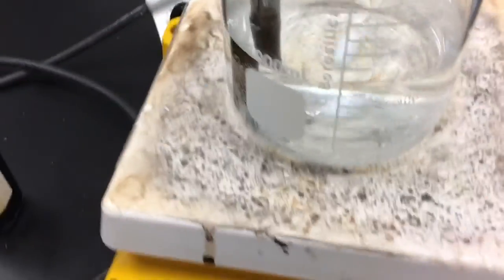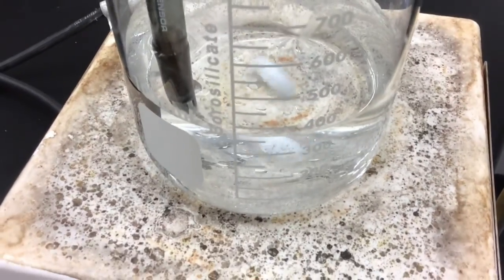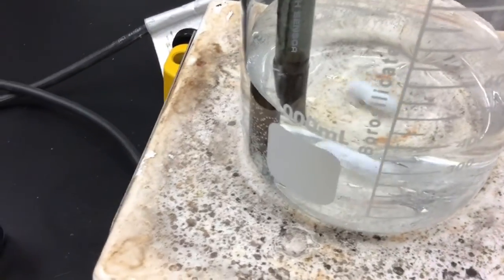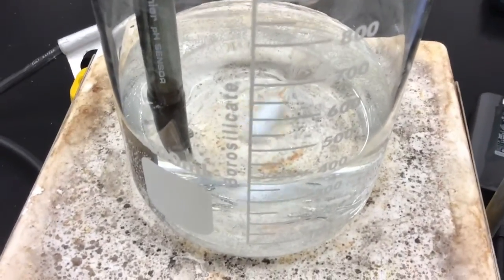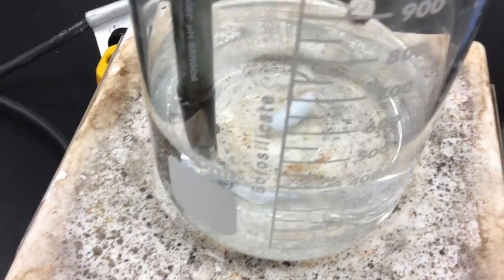Okay, so what we have here now is a beaker of regular old water that's got my pH probe in it and a spinner in it. If it's tap water, then my pH should be pretty darn close to a 7 here. But keep in mind that when you start talking about pH differences, any slight little change is going to result in a fairly significant change in the pH.